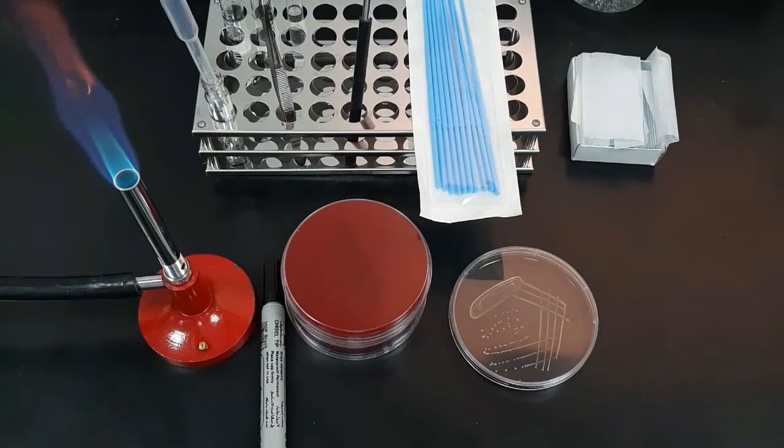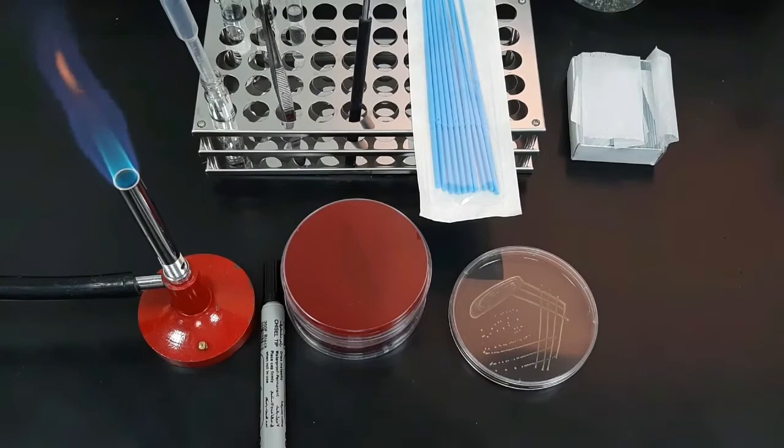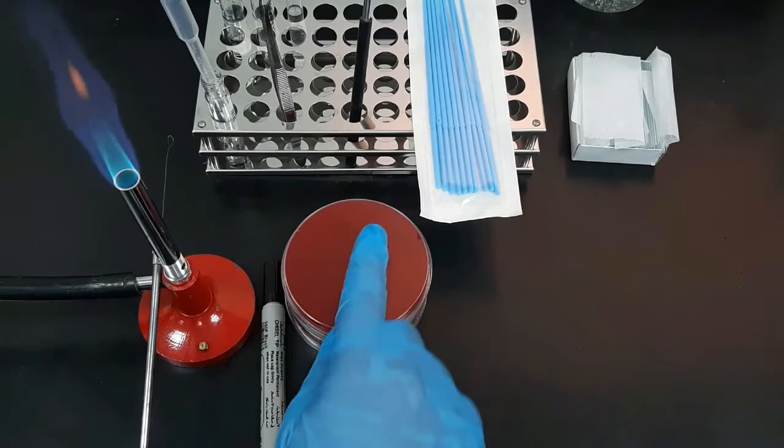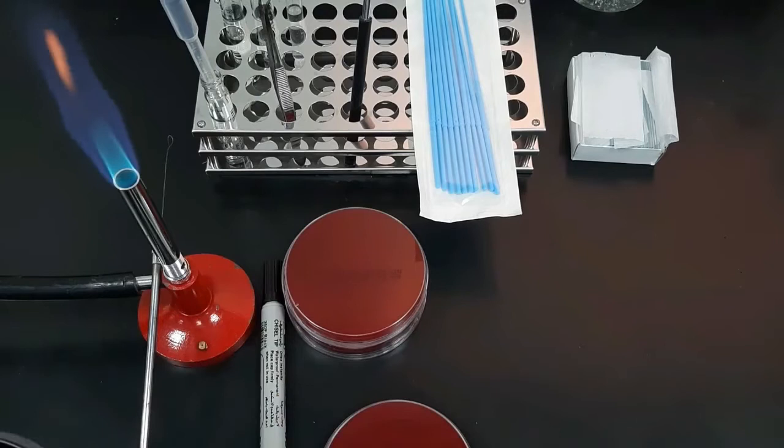To start the procedure, first sterilize the wire loop in the flame and keep it for cooling. After that, mark a fresh culture media plate with the identification name or number.